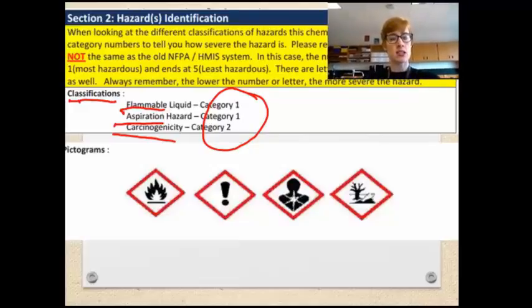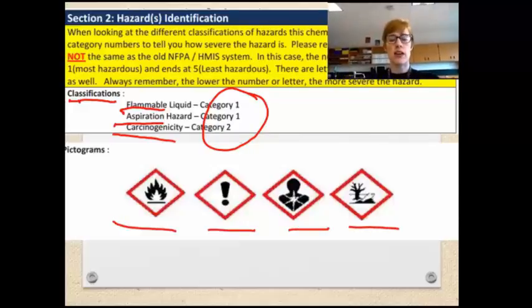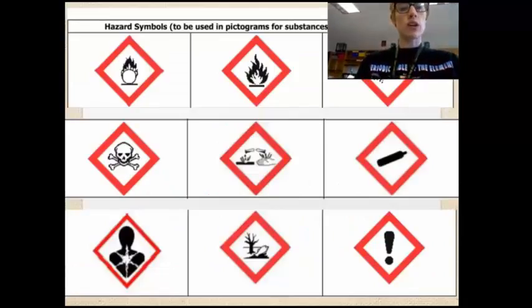And then the next section, we're still in section 2, but the next part of section 2 are the pictograms. And this is something brand new that they have implemented in safety data sheets that they did not use several years back. So this is kind of a new thing, is that they've actually put the pictograms inside of the SDS sheet. So I'm going to walk you through what I think are the 9 most important pictograms, okay?